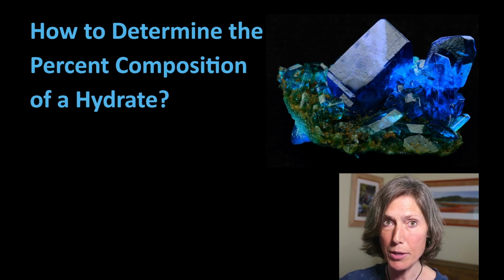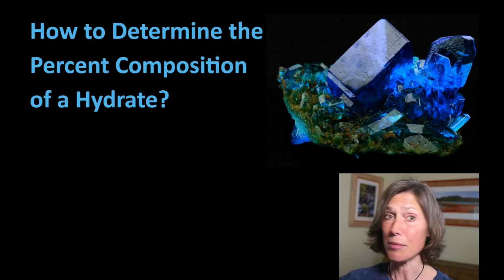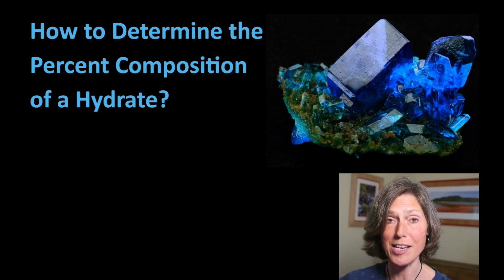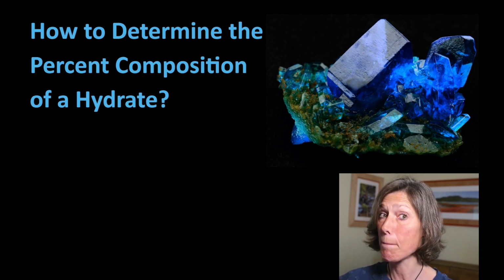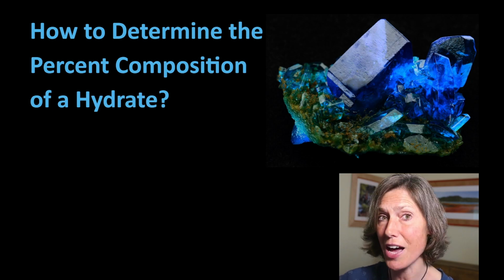So that's the phenomenon. There's very little water present on our moon, but not inside a lake or a stream or a river or an ocean. It's present inside rock. So rock can have water in it. How can we determine the percent composition of a hydrate?